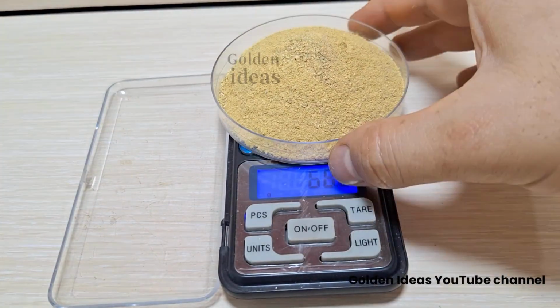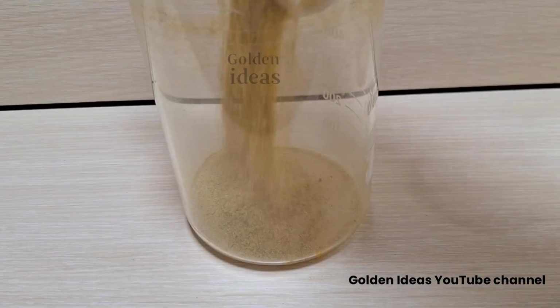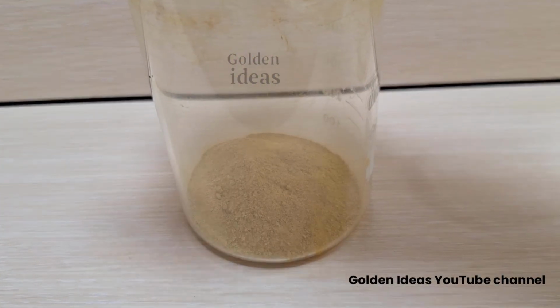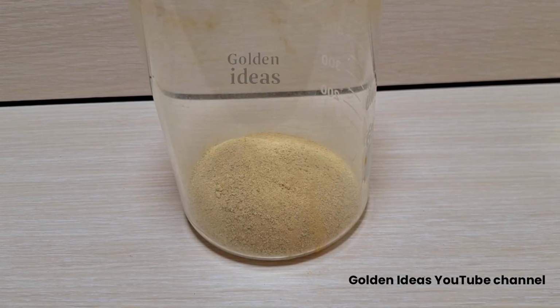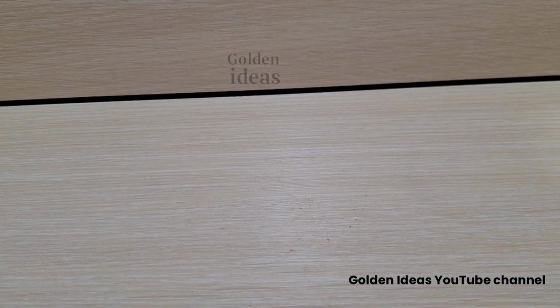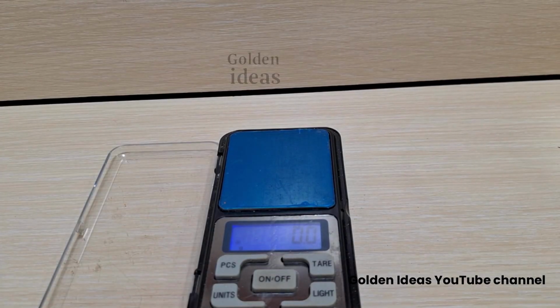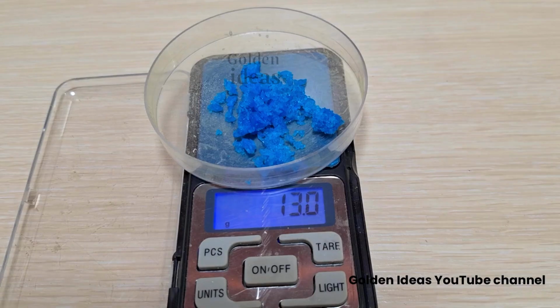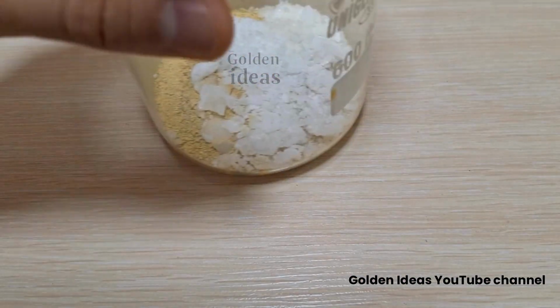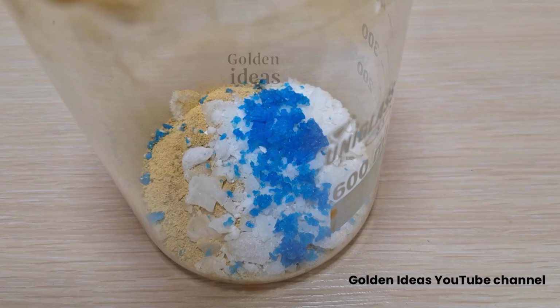By weighing the materials, I will show you how much material you should use on the desired soil scale. If your soil is of good quality, the metals I mentioned will also be present along with the gold, and the gold will not be pure, in which case you will get purer gold by dissolving the obtained metal in dilute nitric acid, for which I will make a separate video. And now it is another matter. Here, we add weight to the gold ions so that they leave the weightless state and separate the soil.